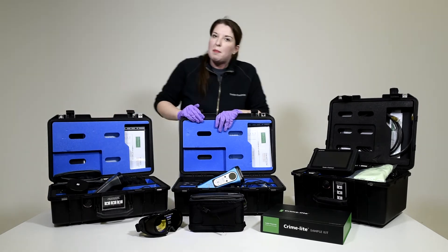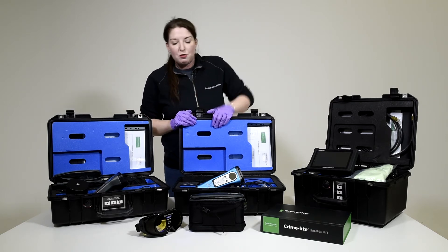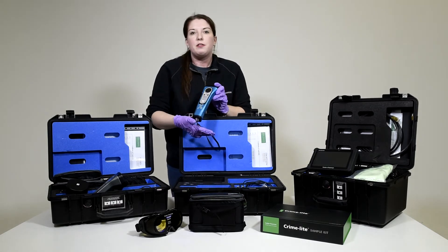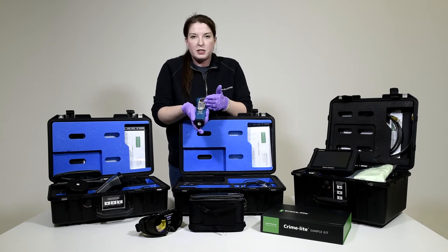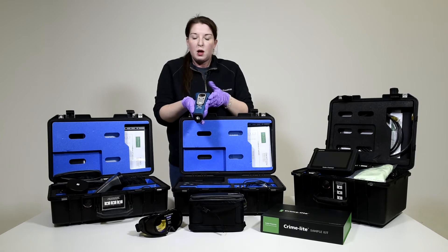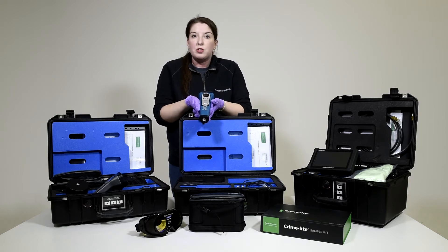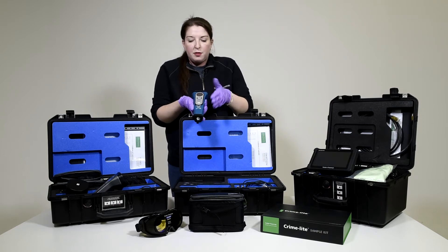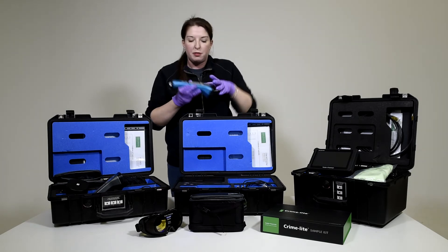We also have the X5, which we've affectionately termed the Serology X, because this works at the lower end of the spectrum — the UV, the violet, the blue, and the blue-green. We've also included a white light source for general searching. Because these are the types of light sources you need to look for evidence such as body fluids, you have fewer wavelengths but more power, as you've got two LEDs per wavelength this time round.